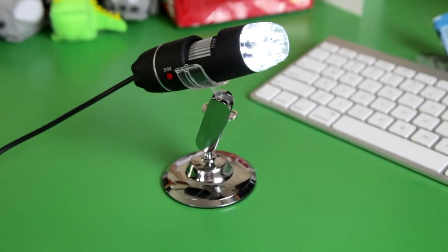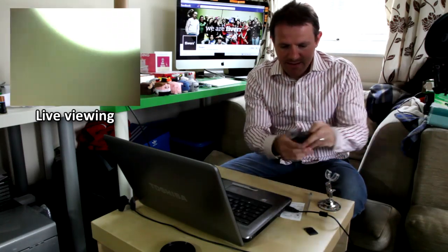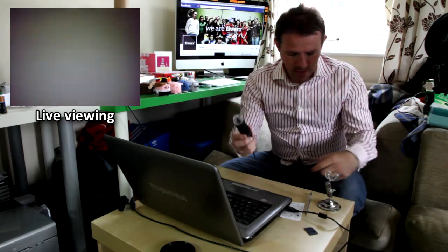Hello everybody, I want to show you the newest addition to my camera collection — it's a digital microscope. I bought it last week, it's 50 to 500 times magnification. I'll show you how it works. You can not just take photos with it, you can take videos with it. I'm going to start it — start capture now. I think it records in AVI.